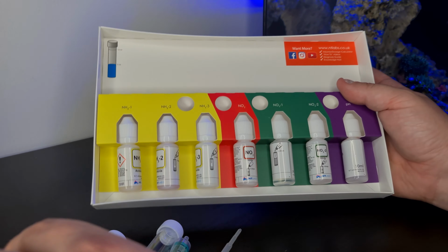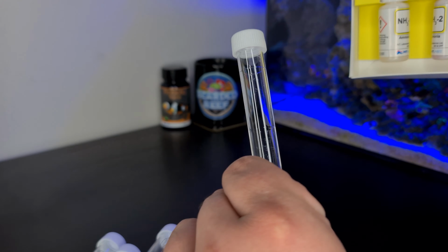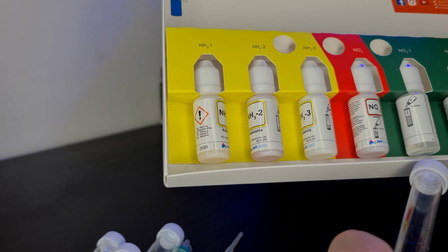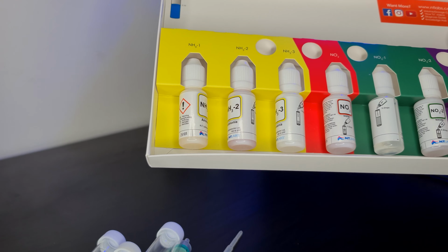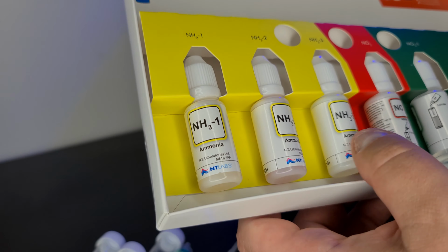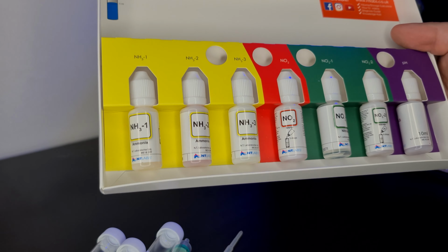And then here are the bottles. If you see there, the lower line on this is the 5ml mark. I don't know if you can actually see the line on this, but there are two lines in the tube. The lower line's 5ml, the upper line's 10ml. You can see three different solutions there: one, two for that one, and one for the pH. So we'll get going. We'll try the first couple, see how we get on with this, and see how it compares. I'm going to do the ammonia one first. Obviously, I shouldn't really have any ammonia in my tank, so it'll be interesting to see what this reads.